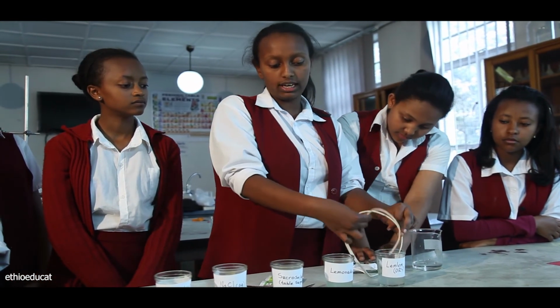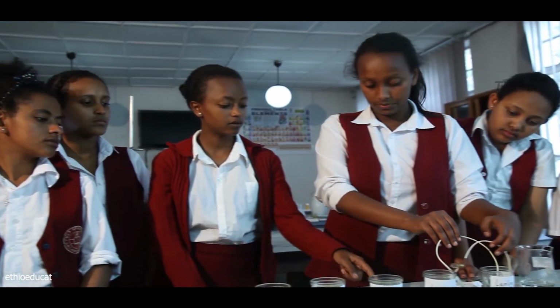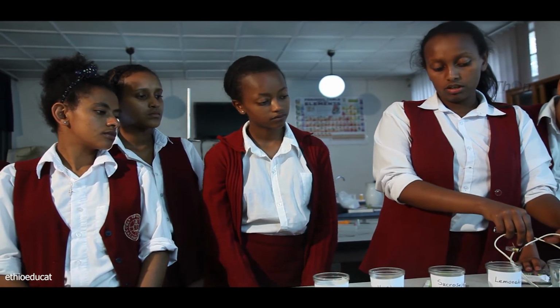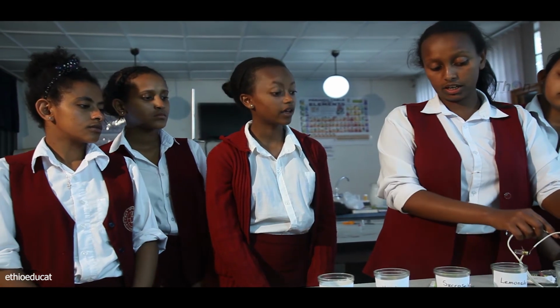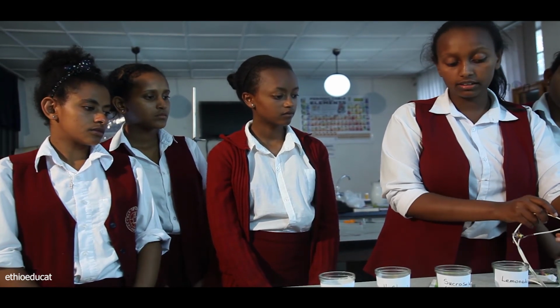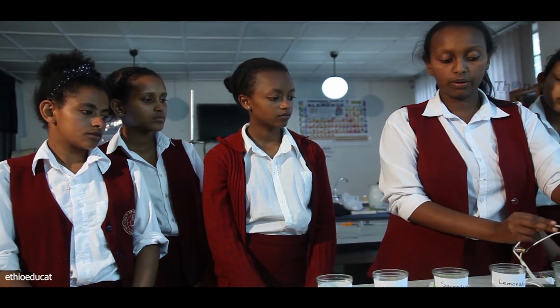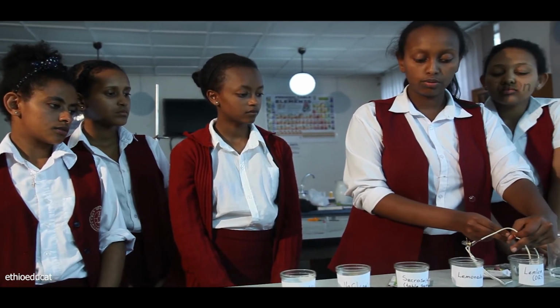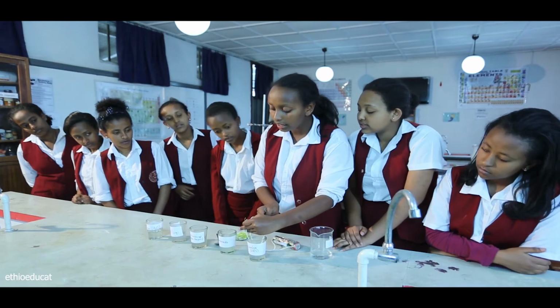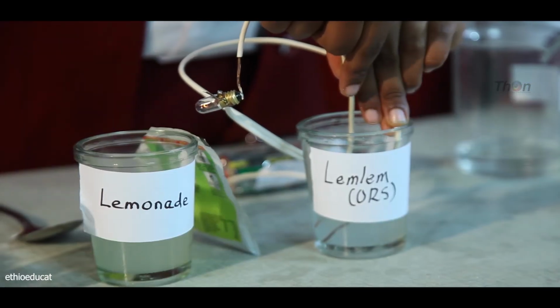So what do you think went wrong here? Can you give me a solution? The amount we add in the solution. I mean the concentration. Okay, so the concentration has an effect because we need many ions. No, the fact that it lit now is just because they touched each other. It's not because of the compound. It's slightly visible. Yeah, slightly visible. Just a small amount. It's not that much though.